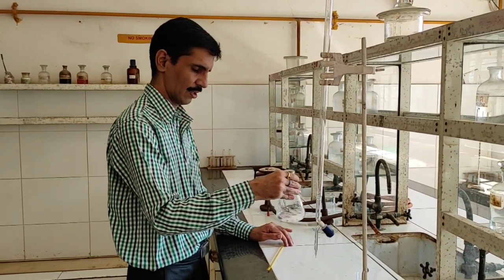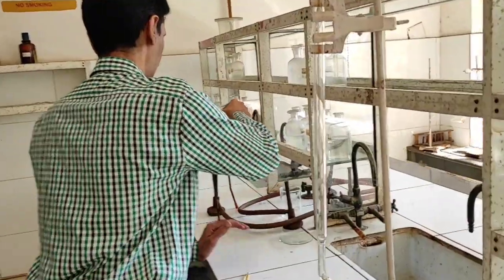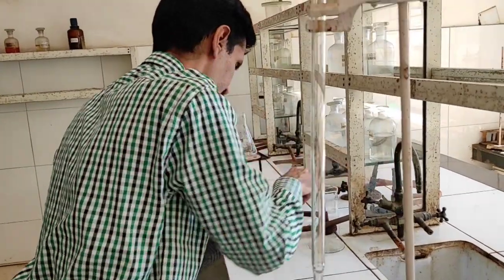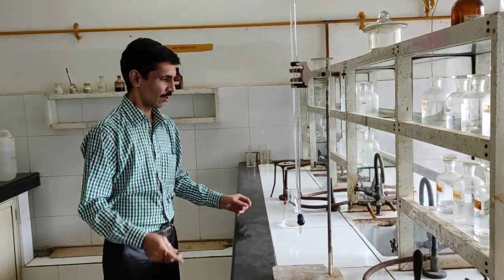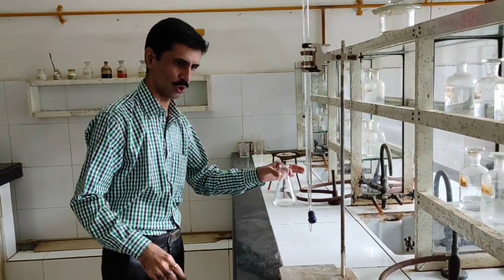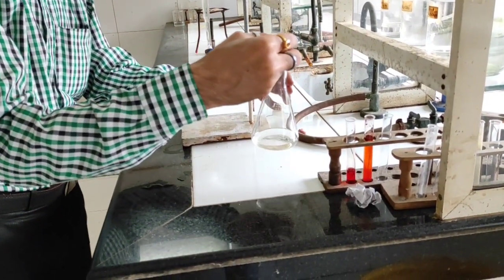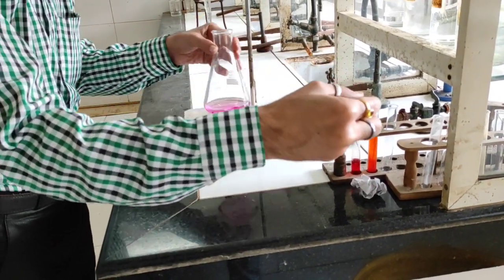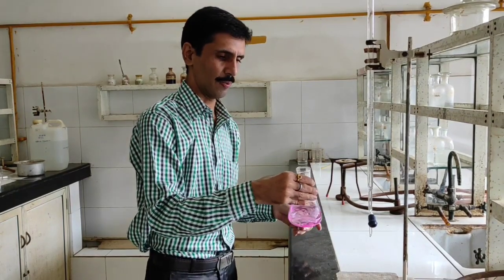And then we are going to boil it gently for around 10 minutes. So here we go for the boiling purpose. So this is the flask, my dear friends, where aspirin is being dissolved in NaOH. It was being boiled, it's cool. Now what we do is add a few drops of the phenol red indicator. And now the titration is going to be against HCl. The burette is already filled with 0.5 normal HCl.